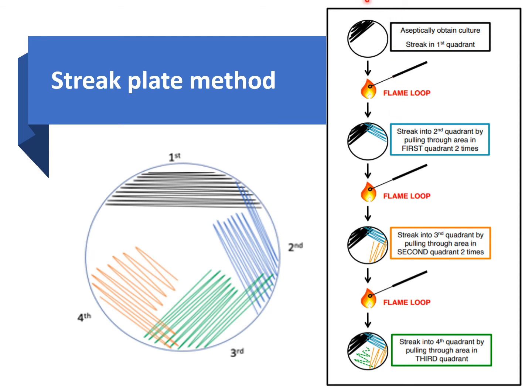So right here, you should have a step that looks something like this, where you grab your loop and sterilize it by passing it into the Bunsen burner until the loop turns red hot, okay? Then wait a few seconds to allow it to cool, and then use it to pick up your bacteria sample, whether from a liquid medium or broth, or from a plate.